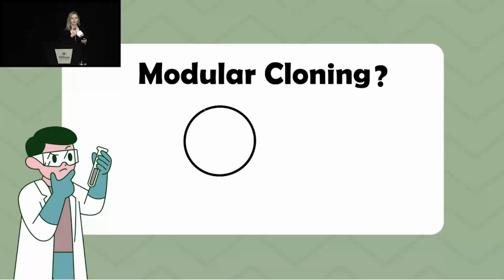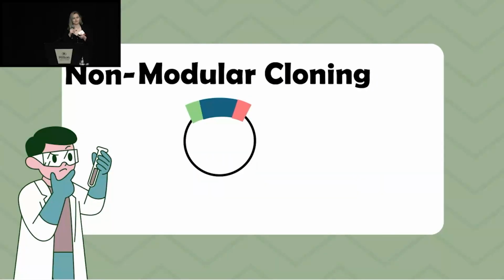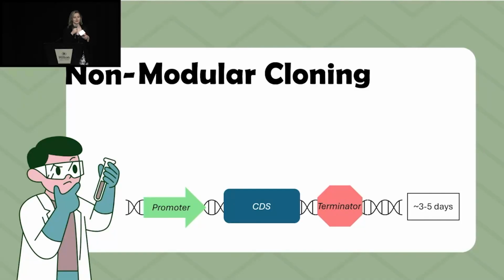So, what is modular cloning? Well, in order to understand this, you have to first understand non-modular cloning. And this is what I talked about last year, but it's essentially putting an insert into a plasmid. And I have a QR code for a little blog on that presentation as well. If you already scanned the first one, you don't have to worry about this one.